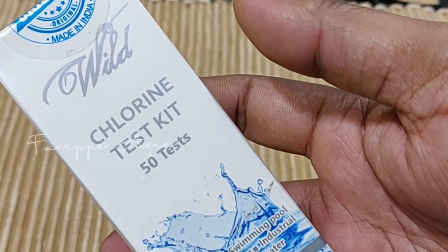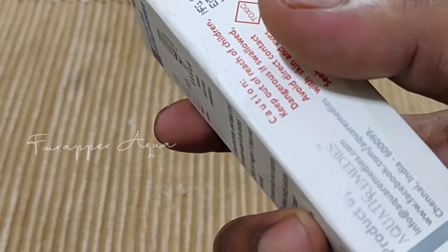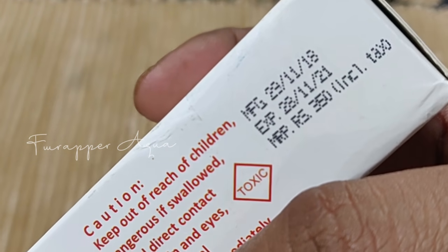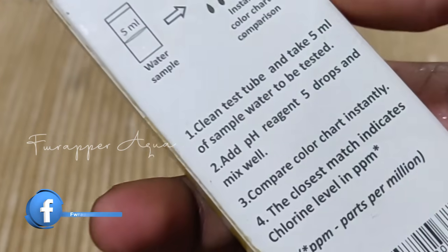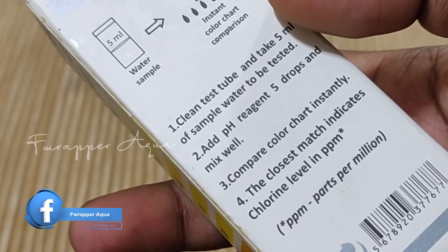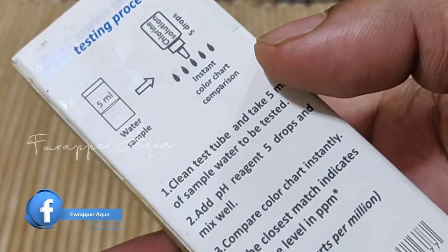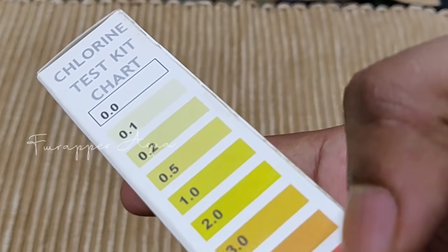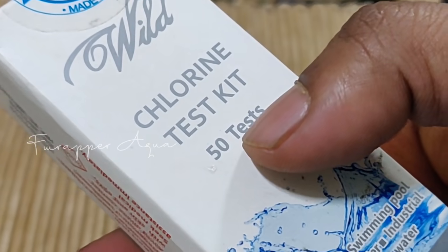This is the Chlorine Test Kit by Aquatic Remedies, which I bought from Amazon. It is about 350 rupees — I'll leave the link in the video description so you can pick it up. This is the basic scale; with one kit you can do 50 tests.